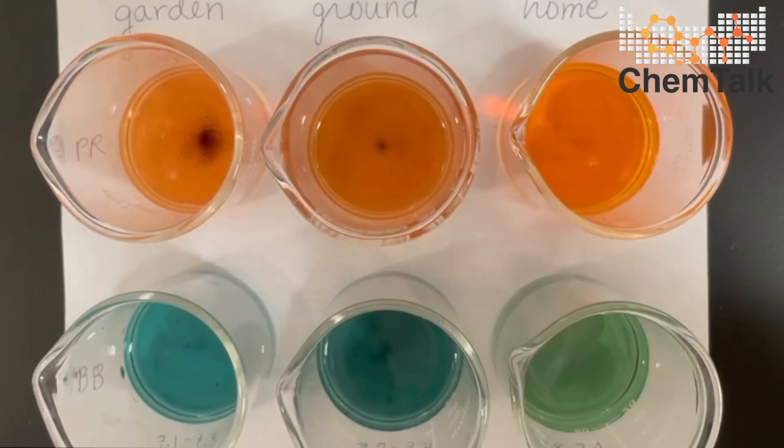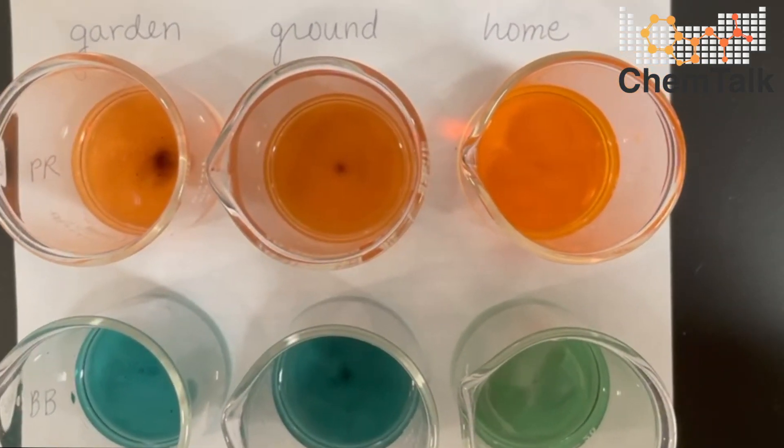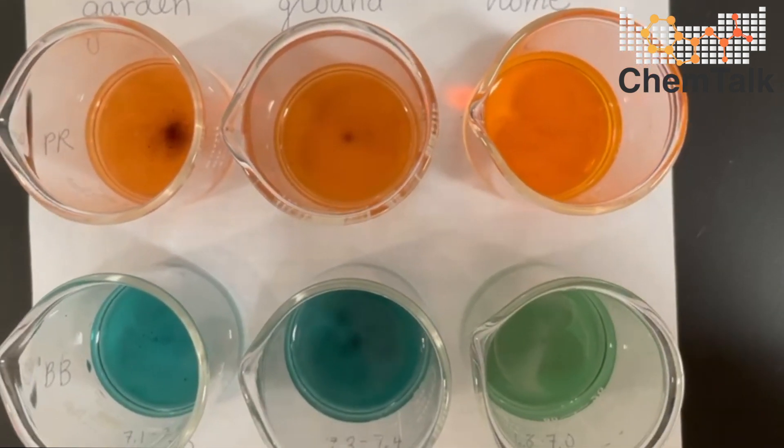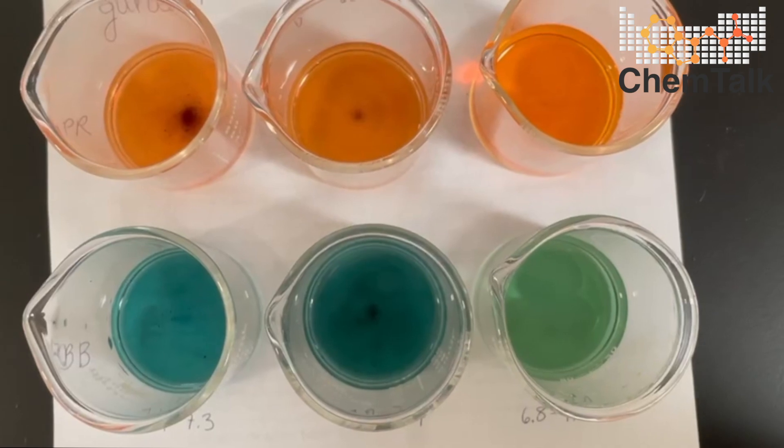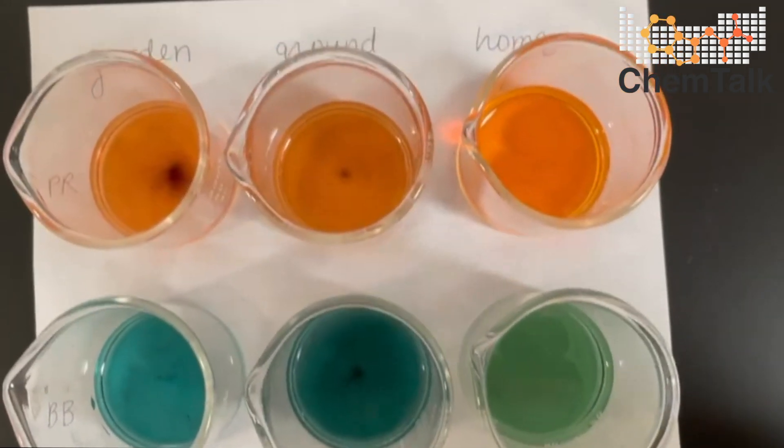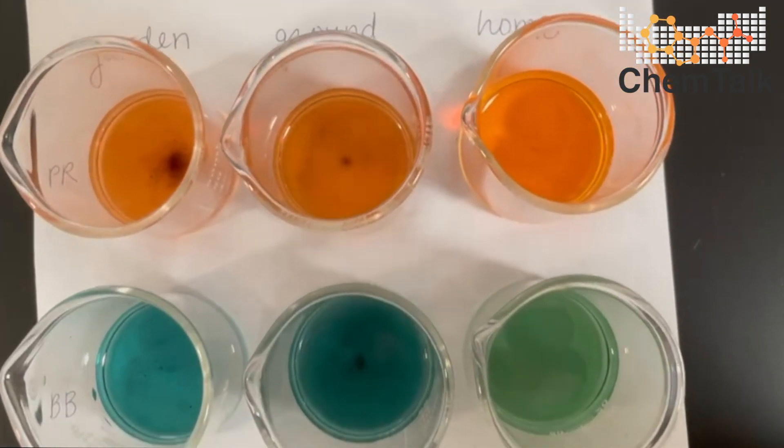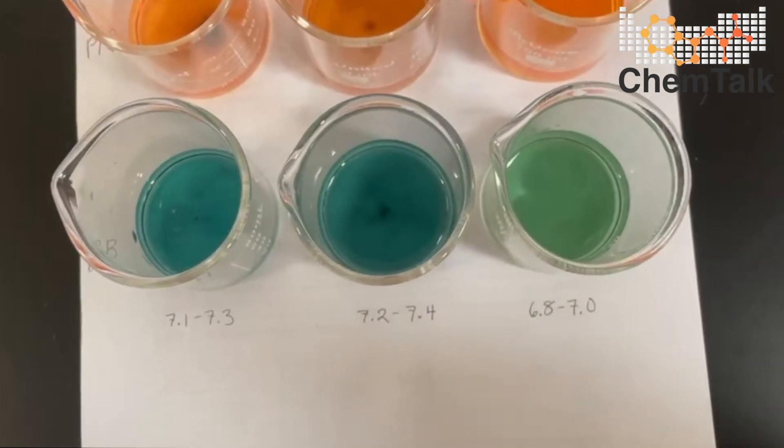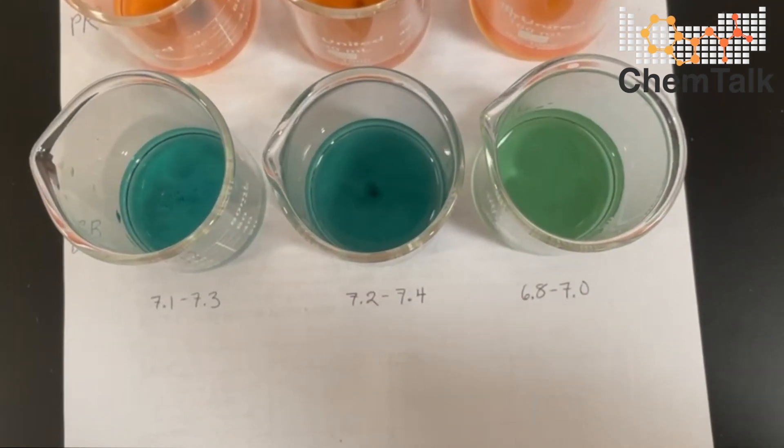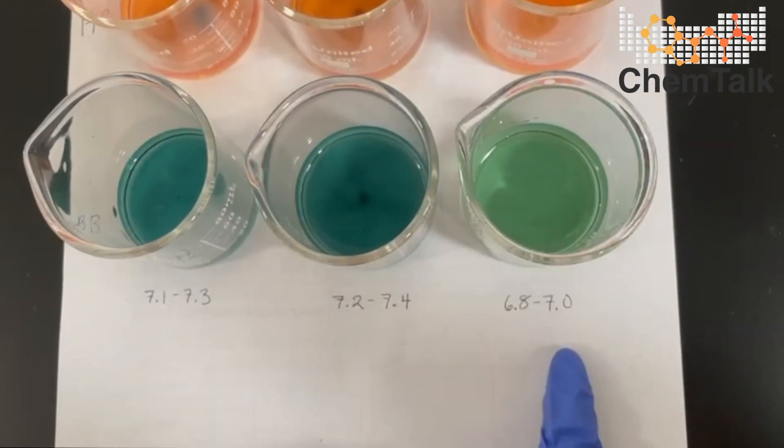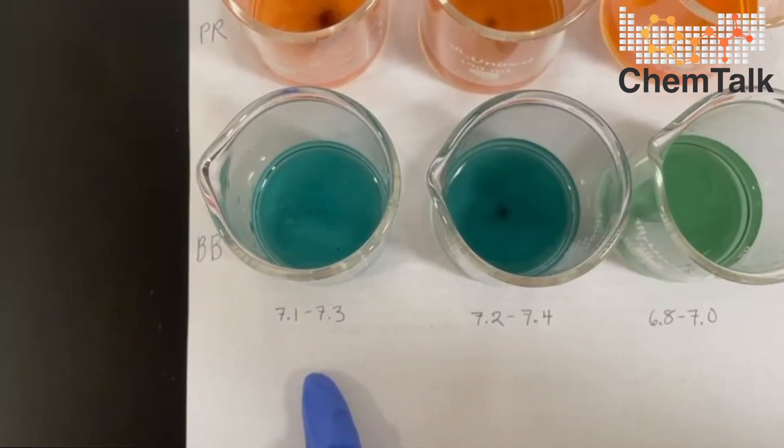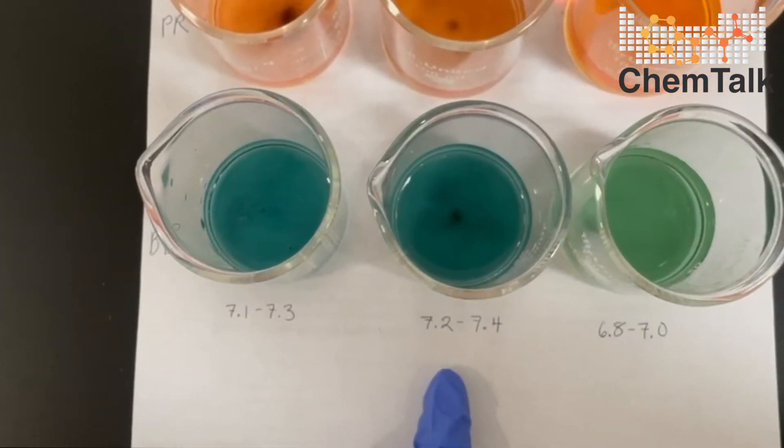So here are the final results. You can see that the phenol red indicator was a little bit less effective because the colors are not very distinct. So the pHs of each of these soils likely fell outside of the sensitivity range for phenol red. However, that's why we use two indicators. The bromothymol blue does show more distinction. And it actually showed us that the soil from my home was slightly acidic. And the soil here from both the garden and the ground was slightly basic.